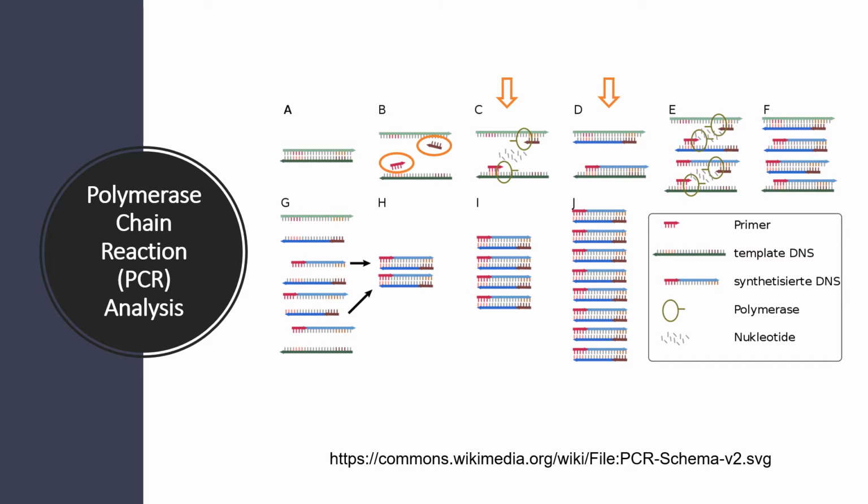This cycle repeats 25 to 35 times in a typical PCR reaction, which generally takes 2 to 4 hours, depending on the length of the DNA region being copied. If the reaction is efficient, the target region can go from just one or a few copies to billions. The results of a PCR reaction are usually visualized, made visible, using gel electrophoresis.